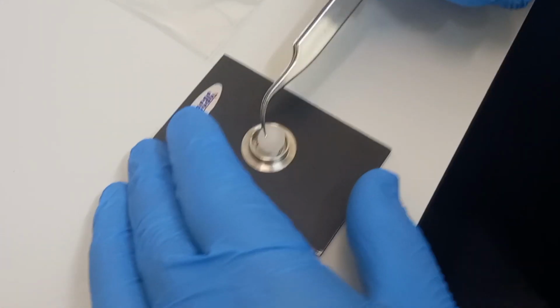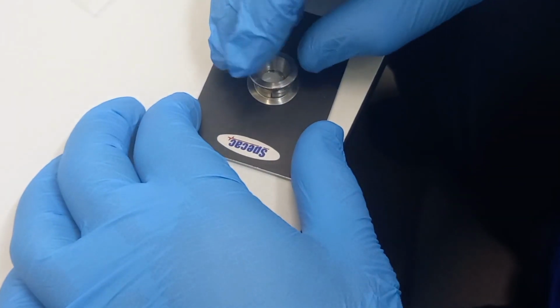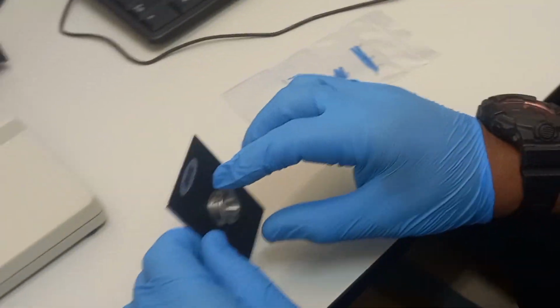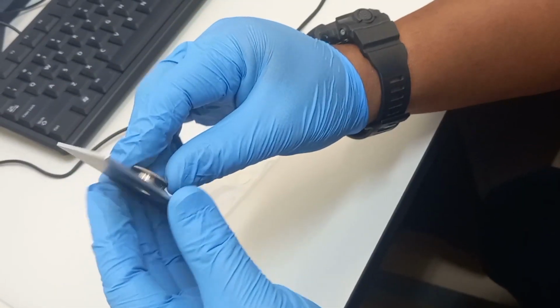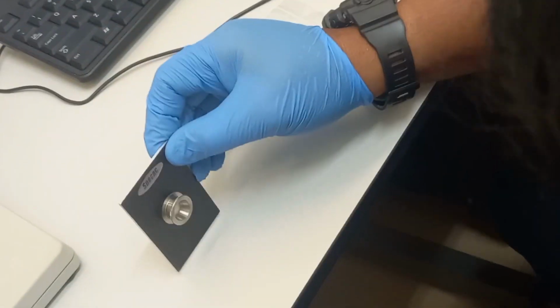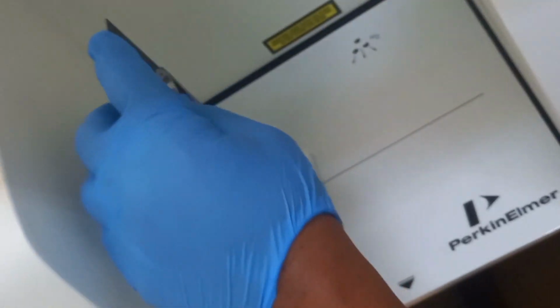Then we will place the prepared sample in the FTIR. Ensure that the sample is properly positioned to optimize the signal collection. The sample should be thin enough to allow sufficient infrared light to pass through. So this is the reason why the peaks are low. When you add more sample, the pellet will become thicker and the precise results or precise peaks may reduce.